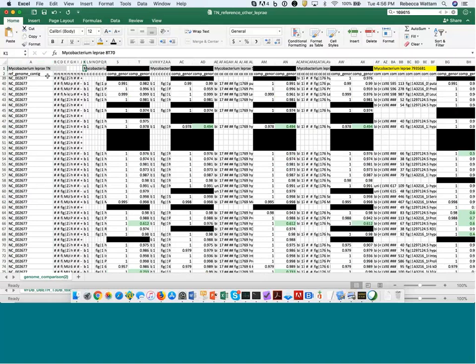What you would need to do is relaunch the tool using this genome as your reference genome with the same comparisons. I always do this. I take all the genomes that I'm interested in, and each one is the reference genome at some point, because I'm interested in finding all the areas that are unique within the entire pangenome of all of these organisms.